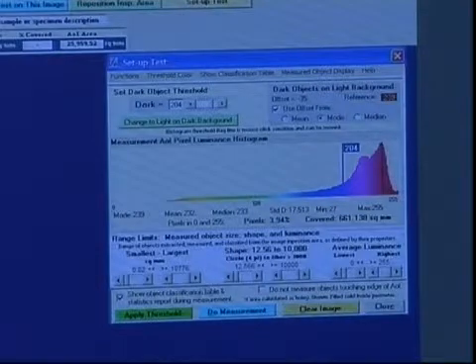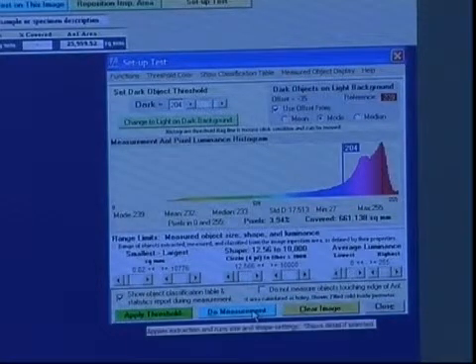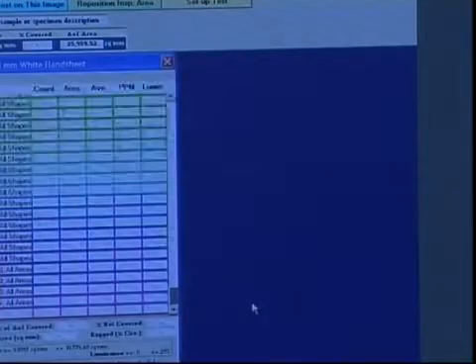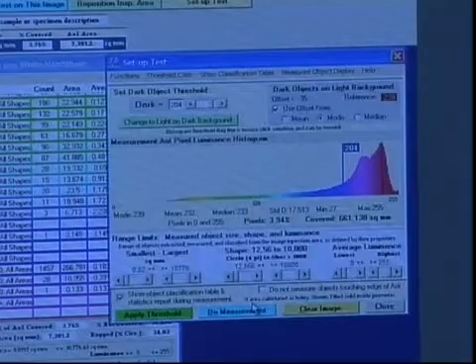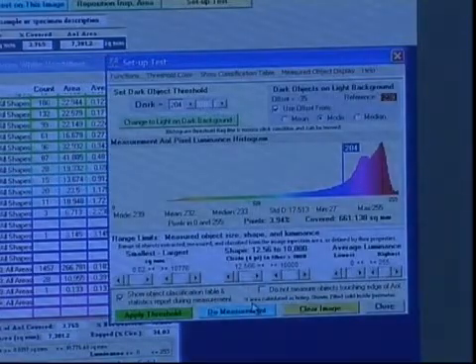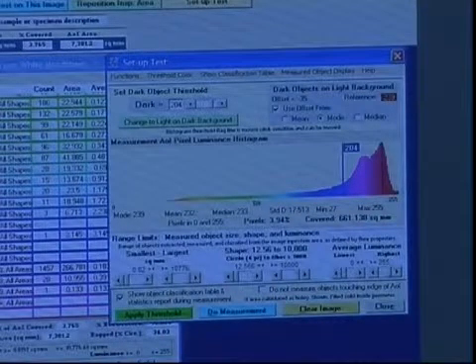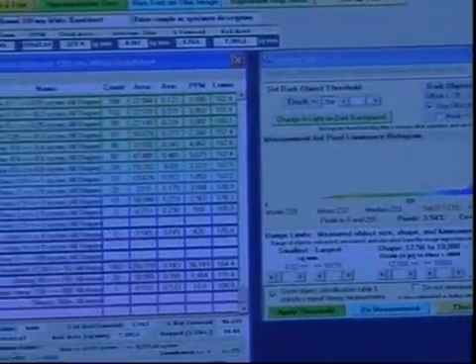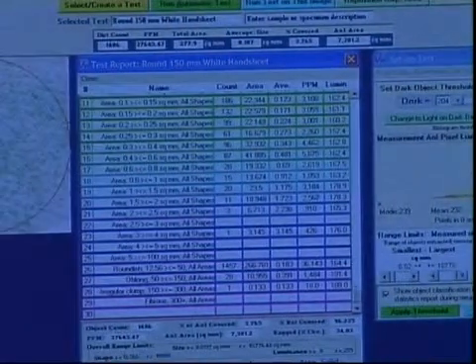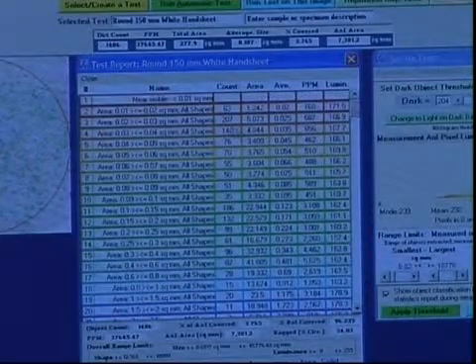We have done all the settings. We're filtering out everything that is less than 0.02, but I can tell you that this hand sheet is very busy, and we'll make the calculation anyway. It's kind of typical of what may come out of the pulper, but you can see that we counted 1,486 dirt particles in that small area of the hand sheet. Very busy. The ppm is out of sight. It's 37,000 and some.